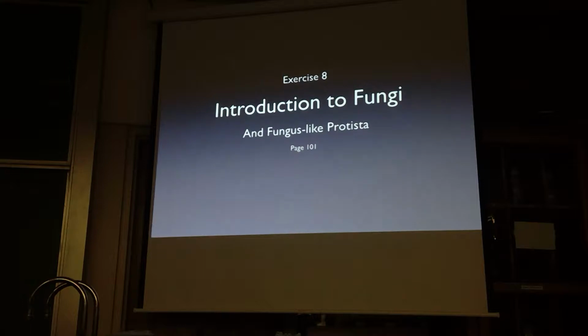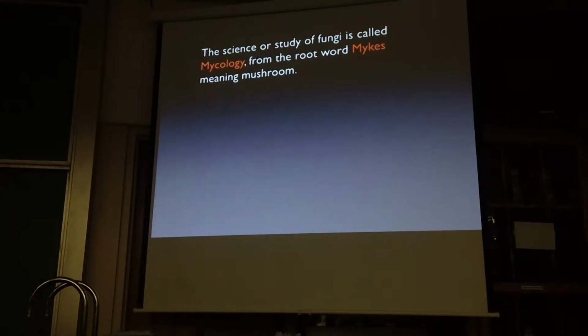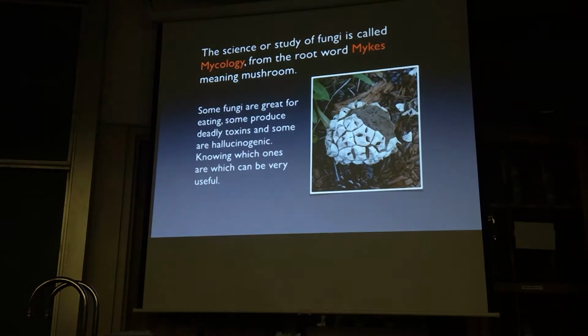So this is a lot of repetition from information that I presented in lecture because we did lecture on fungi. And here we're looking at slides of fungi. So the science or study of fungi, again, is mycology. The root word myces means mushroom. Here you can see a puffball.